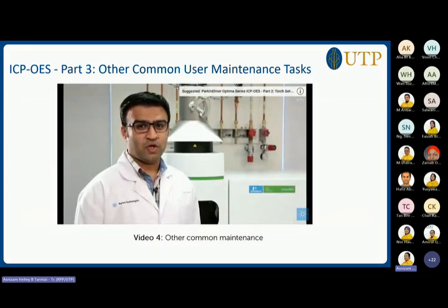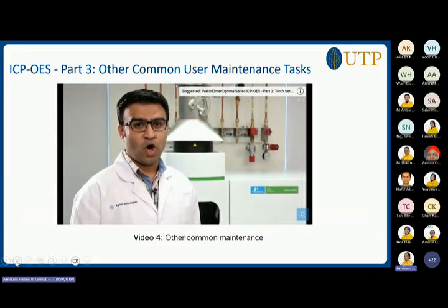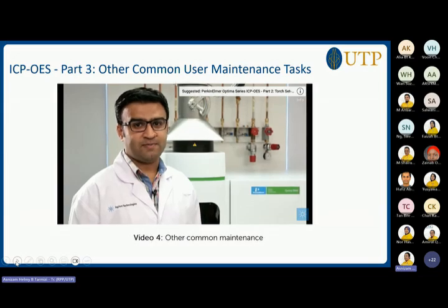Please see the other videos in this series for torch maintenance and sample introduction system maintenance on your PerkinElmer Optima ICP-OES.